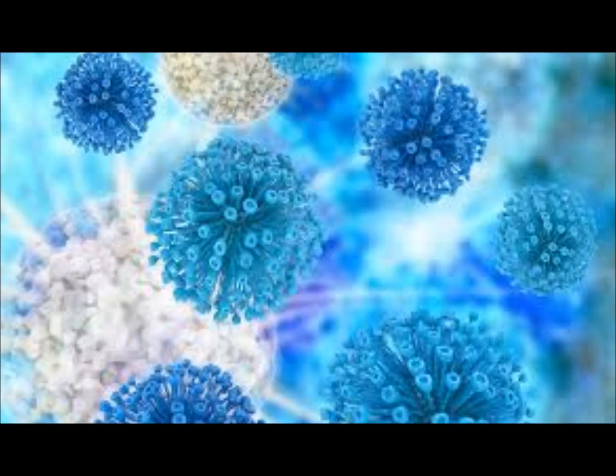Those are bad. The dimorphics are what you get from an aerosol inhaling. So we would never bring a dimorphic in to play around in lab. We don't have a great enough environment for everybody to work under the hood. So always be thinking aerosols is a brand new infectious process when we work with micro. Don't be flinging things around or your loops or anything.